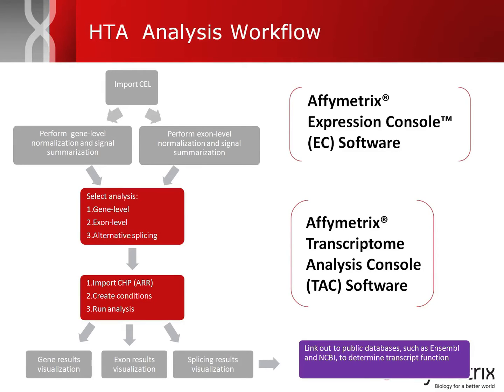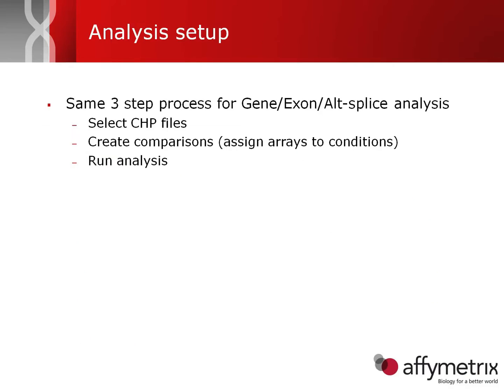In today's video, we'll be going over how you set up an analysis in the TAC software for each one of these analyses.